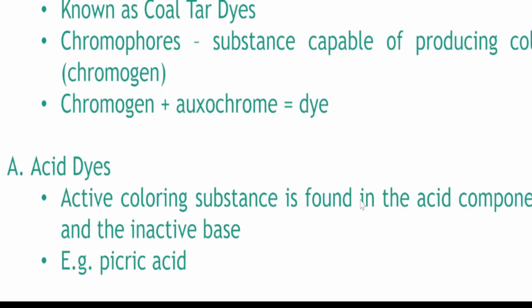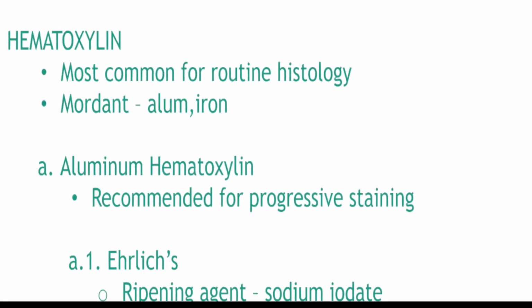Remember when we stain our cells in supravital staining? It's new methylene blue, right? It's a basic dye with several concentration differences. That's why it's called new methylene blue.